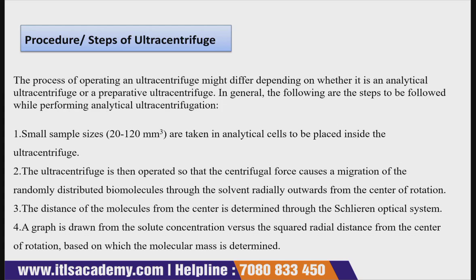In general, the following steps are to be followed while performing an analytical ultracentrifugation. The steps are generally different for each type of centrifuge, whether it's an analytical ultracentrifuge or a preparative centrifuge. So now let's discuss a very generalized set of steps that are used while performing analytical ultracentrifugation.